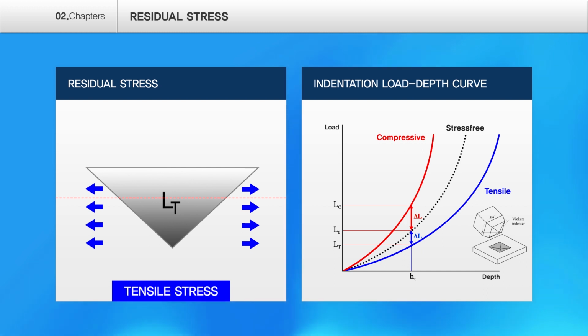On the contrary, if the same material but compressive stress from the sides is being indented, its maximum indented depth is reduced with the same load applied, which means higher load is needed to reach the same indentation depth. The technology of IIT is to evaluate the value and direction of residual stress non-destructively from load difference between stressed state and stress-free state that occurred during these processes.